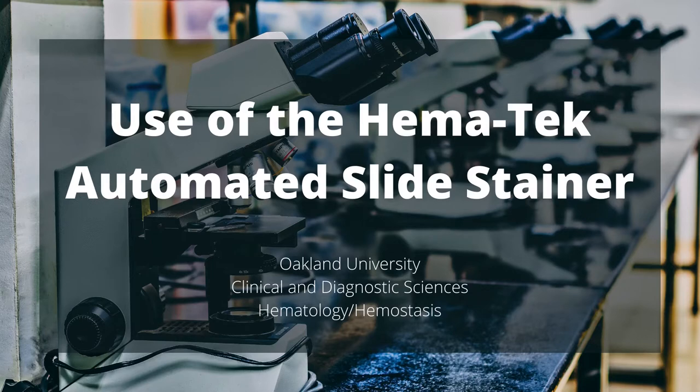The purpose of this video is to demonstrate the use of the HemaTech automated slide stainer procedure. Please feel free to follow along with the protocol posted in Moodle.